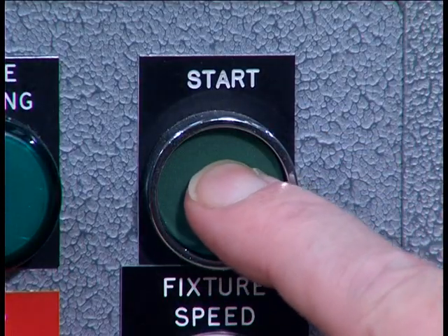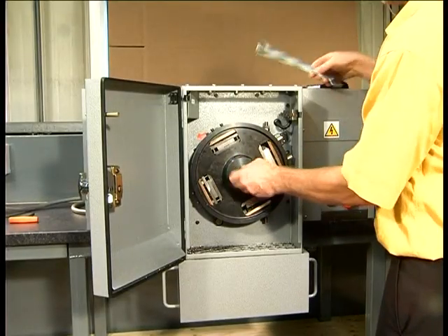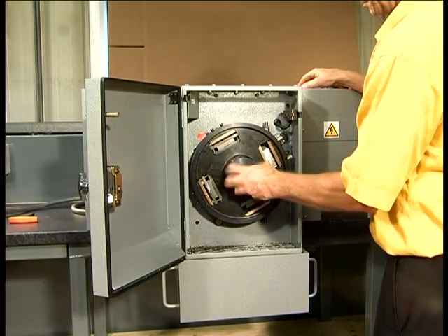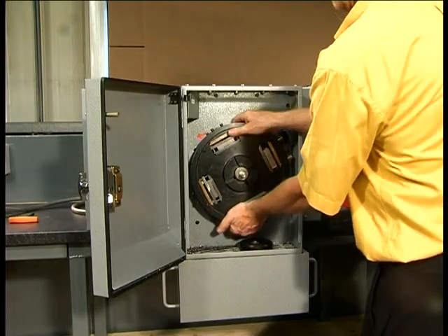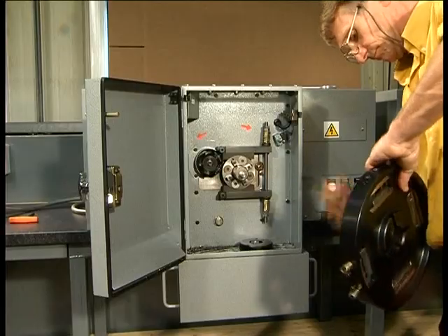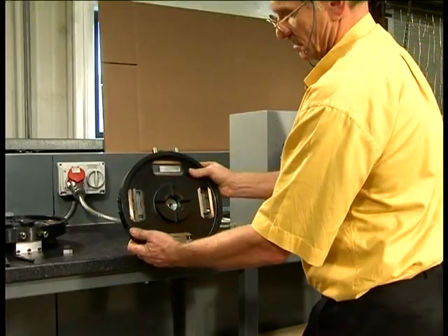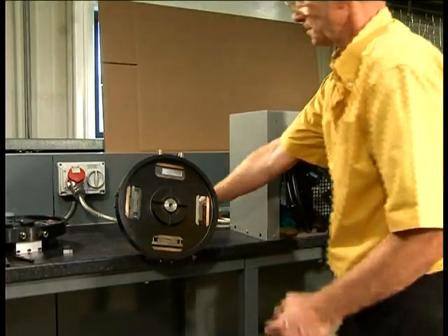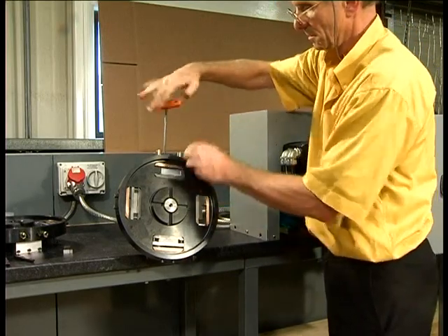Push the start button and the second cut has been completed. Remove the fixture from the machine and place on the special stand provided. Remove the two specimens from the first and second cut pockets and the two dummy specimens from the third and fourth pockets.